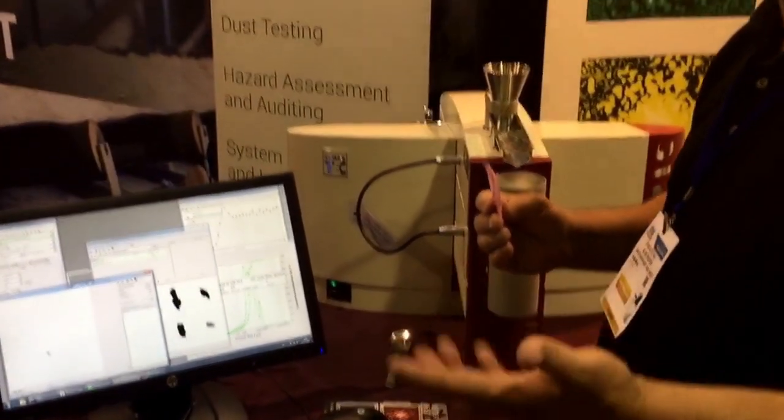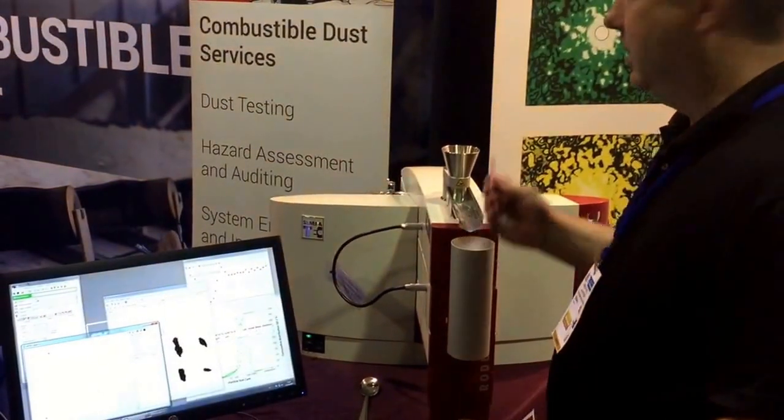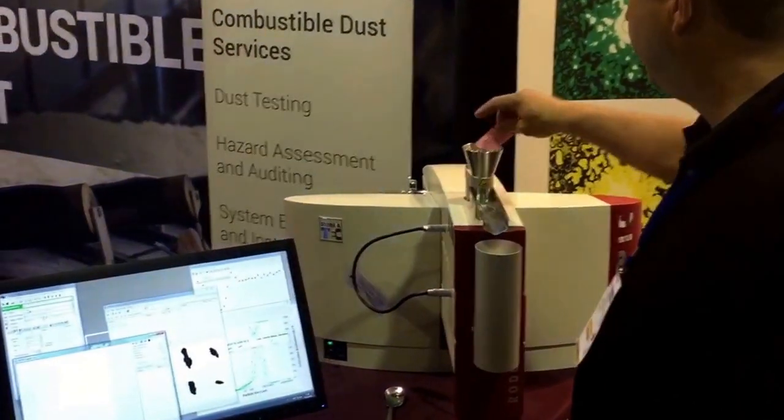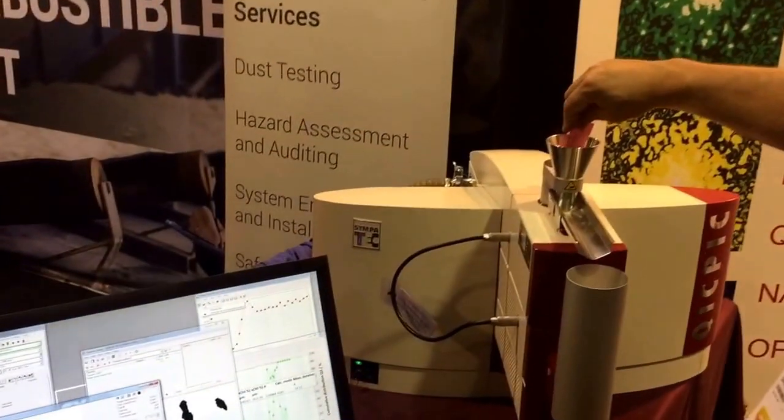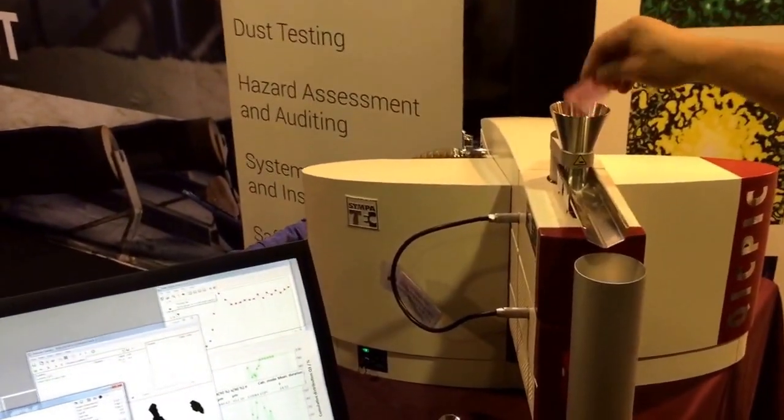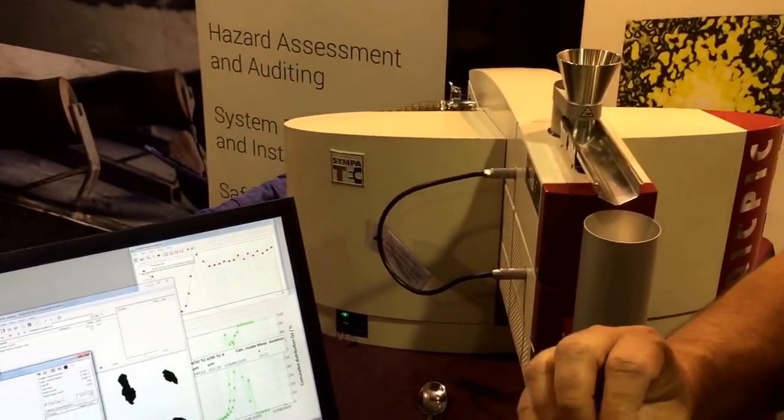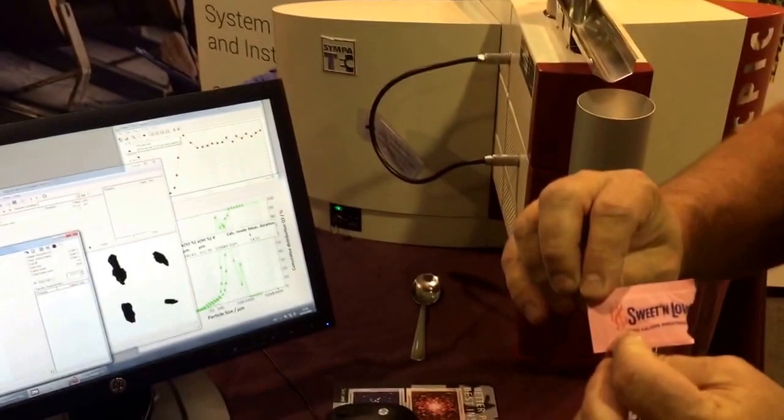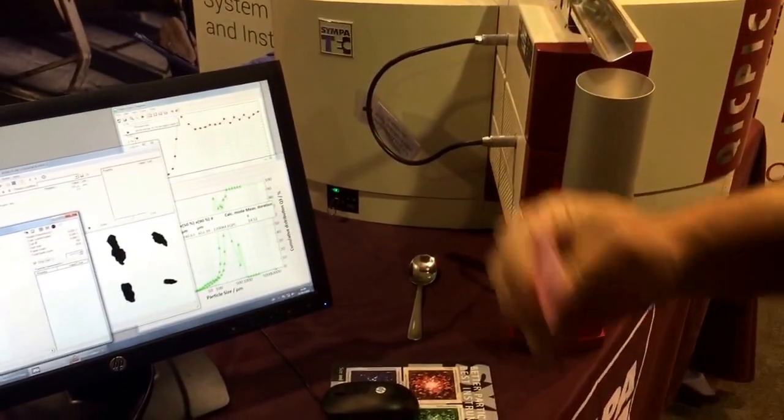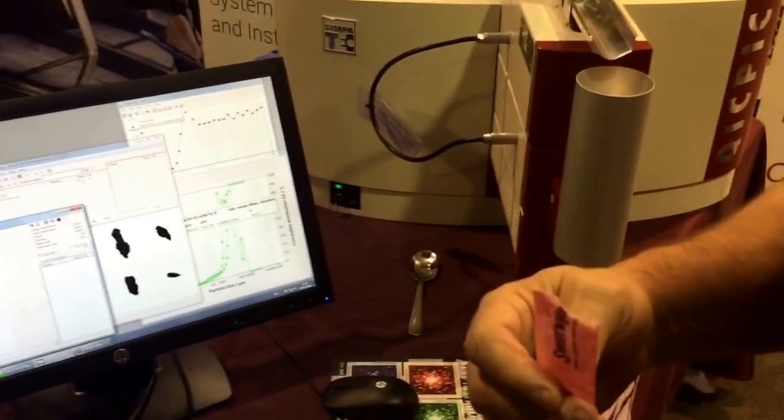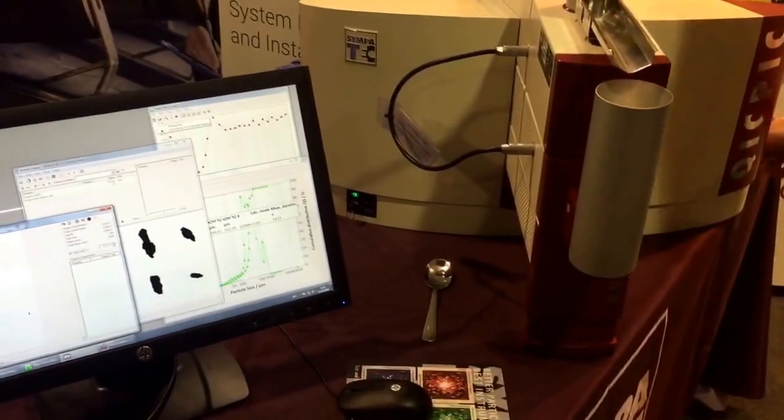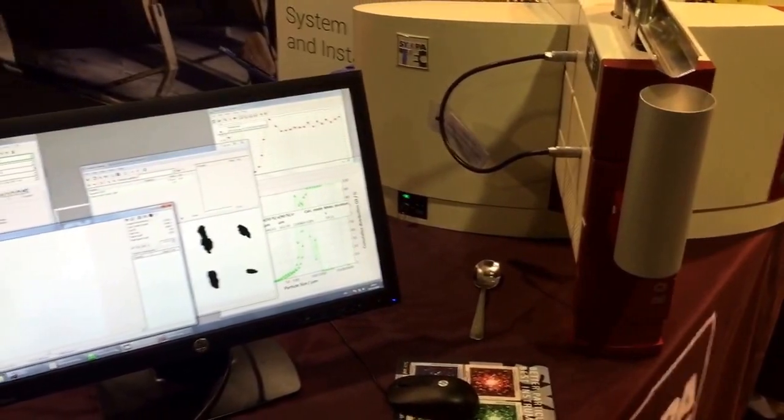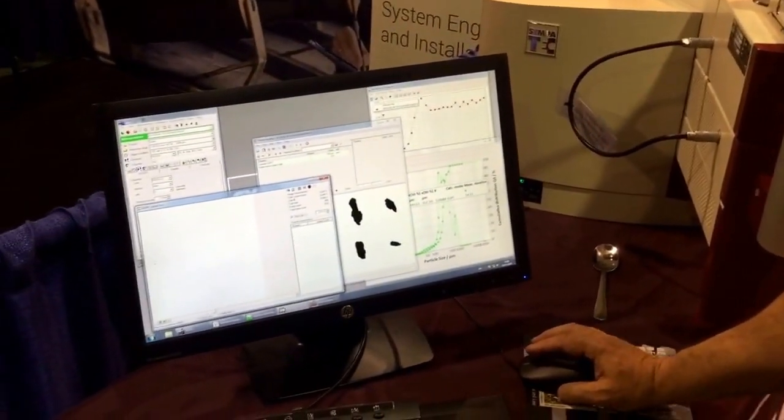In this case, I'm going to put a little powder, sweet and low in here. Could be sugar, I ran out of sugar so I went with sweet and low. So then it's just a matter of once you disperse it.